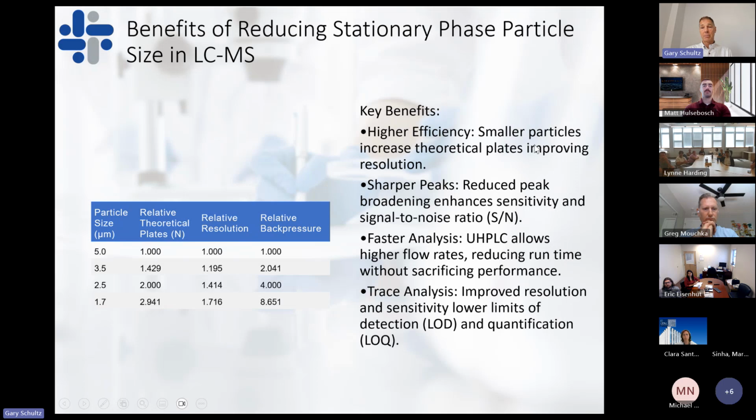So that gives us better separation efficiencies, and also sharpens chromatographic peaks, which improves signal to noise when coupling these technologies with quantitative detectors such as mass spectrometry.